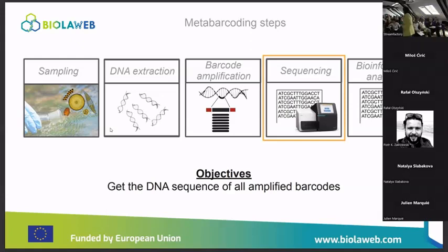Yeah, in fact, we will talk about this in the talk just after you. We tested several extraction kits and methods, and one was better than the others. The silicate cell wall is a big problem when you have lots of phytoplankton blooms of diatoms, but I don't think it's a problem in biofilms. I don't know if you have other explanation, Agnes. Do you? No. But we are not, for instance, using.